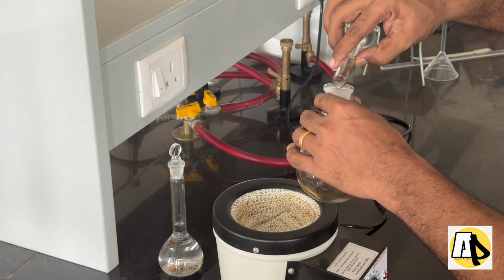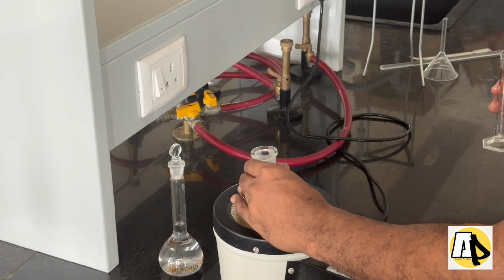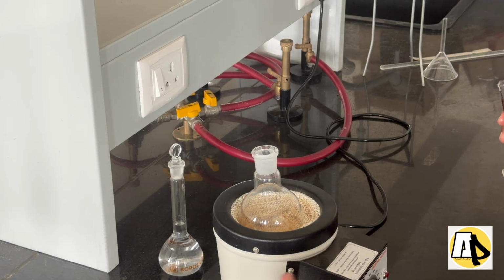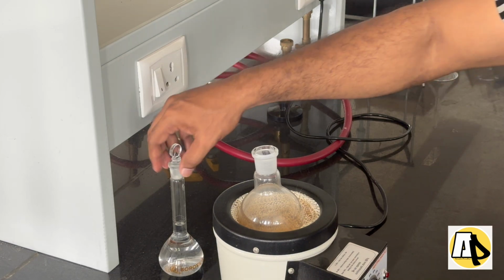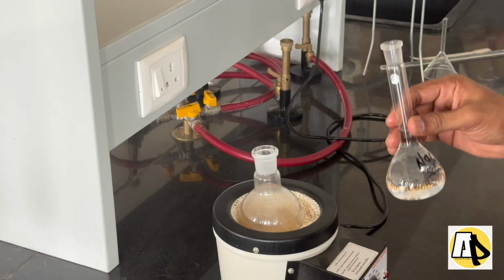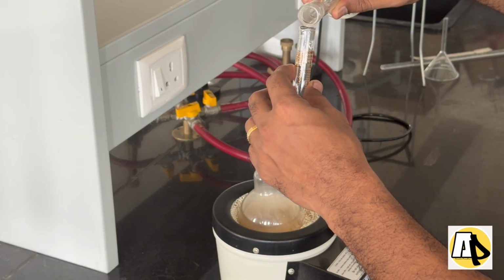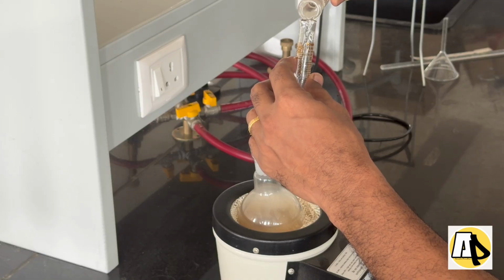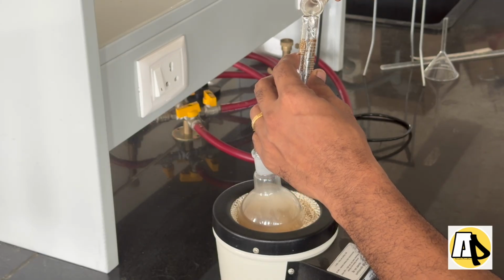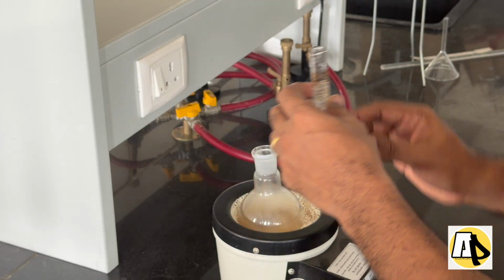You are pouring into the round bottom flask 2 ml of methyl salicylate, and into this we need to transfer 15 ml of sodium hydroxide. This is 10% sodium hydroxide. Prior to the lab we have prepared it. 10% sodium hydroxide, 10 grams in 100 ml.